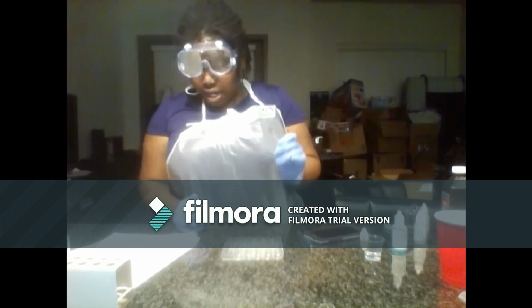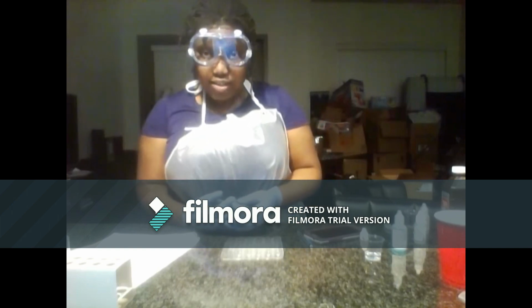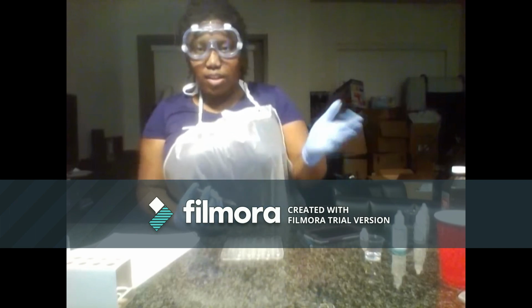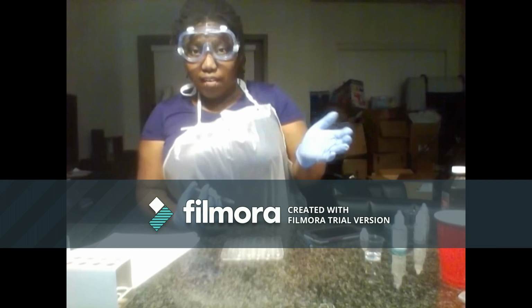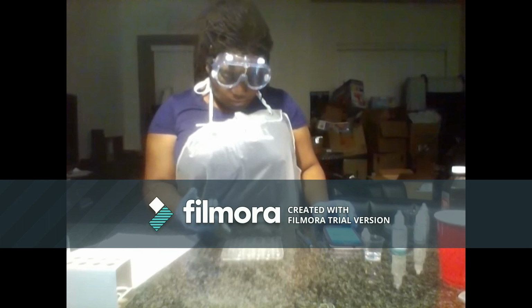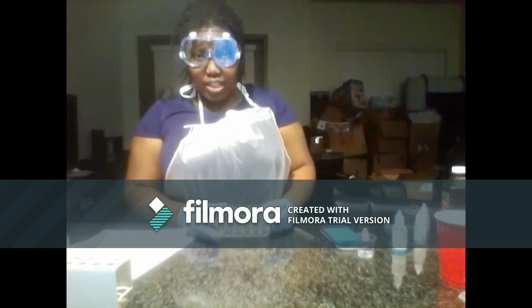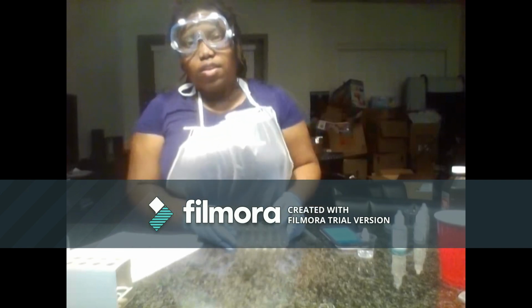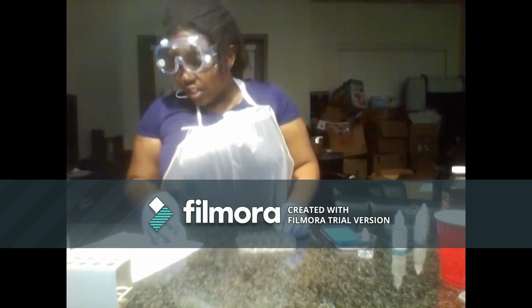Now I have my hydrogen peroxide, and I'll be beginning my reaction. So I'll do the first one on camera, and then I'll do the consecutive ones, and I'll come back and show you that I finished. Alright, so I finished all 5 of the reactions, and I recorded my times in my data table. This completes the video section of this.